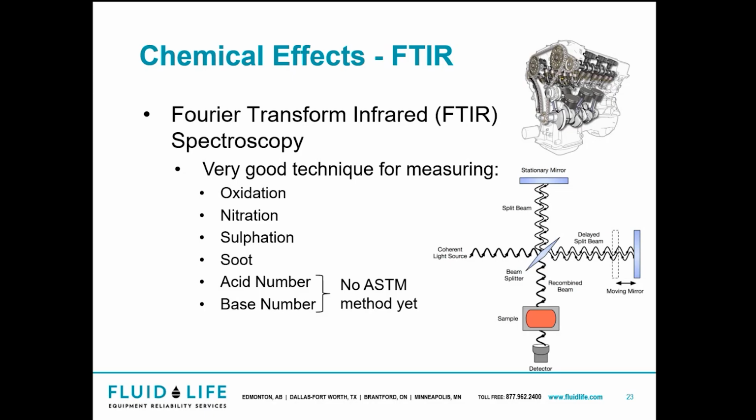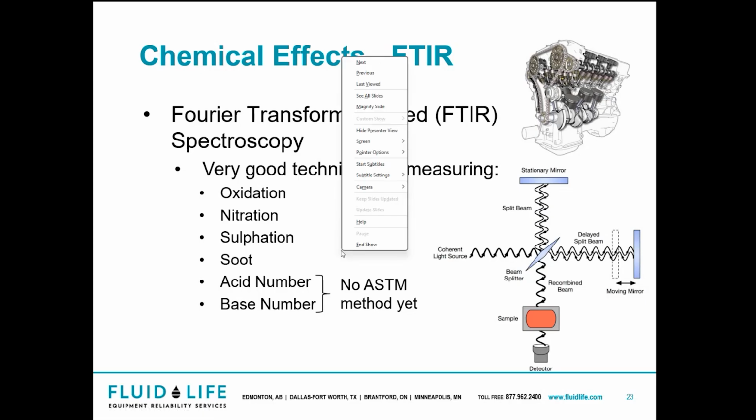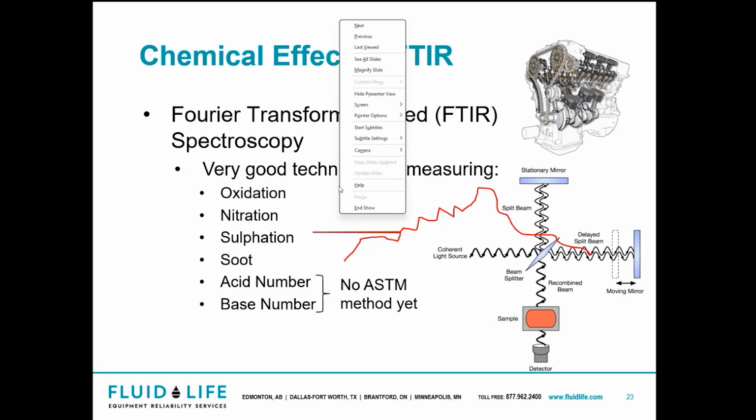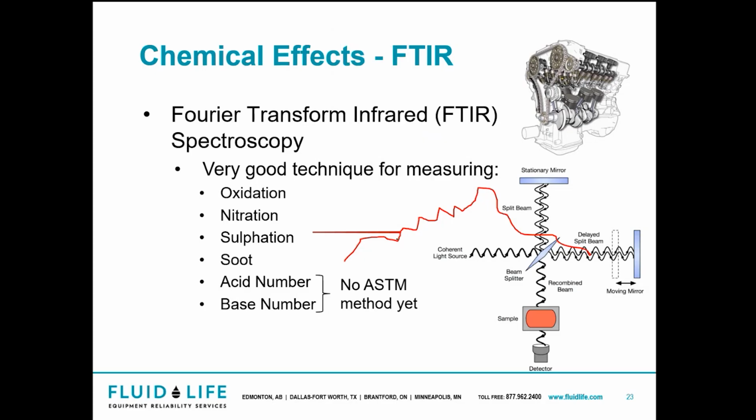So you're going to need to send us a reference sample, and then what we do is we compare the wavelength differences. I'll crudely draw something on the slide here for you. Ignore that line that just popped out there. Say this is what your wavelength would look like for your reference sample. Well, your tested sample is going to have a different wavelength.